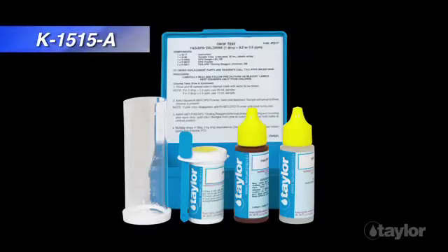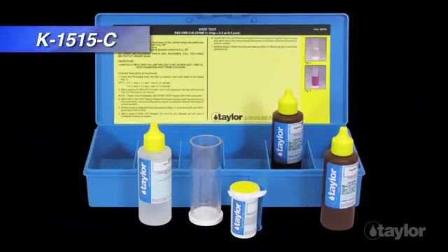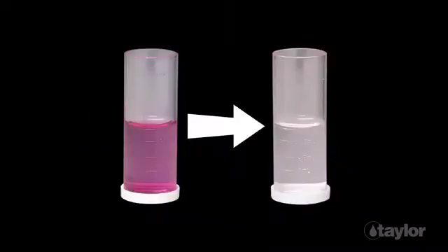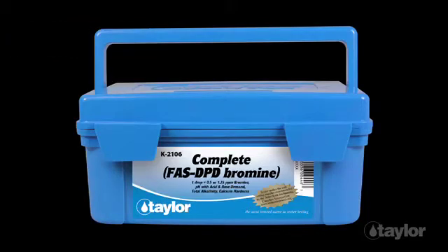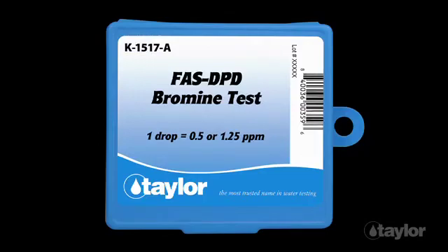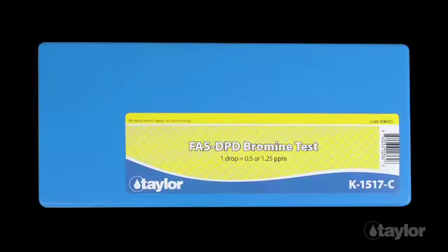The FAS-DPD test for chlorine is also available in a standalone kit with either 3/4 ounce or 2 ounce liquid reagents. The procedure is identical, except the tests are performed in the number 9198 sample tube instead of the number 9058 comparator block. If your sanitizer of choice is bromine, the FAS-DPD method can be used to determine total bromine too. The procedure is similar, but the drop equivalency is different. Namely, 1 drop is equal to 0.5 or 1.25 parts per million total bromine. You cannot use the FAS-DPD test for chlorine to determine bromine levels.